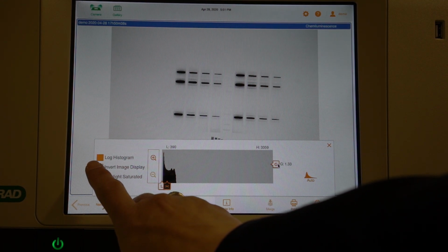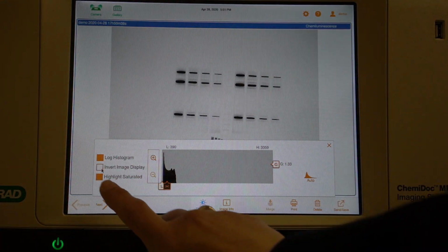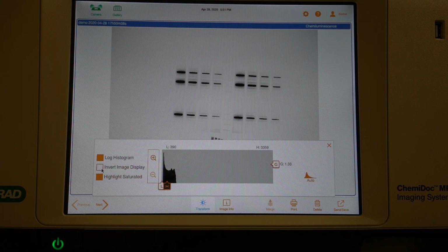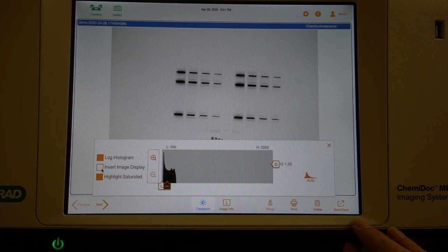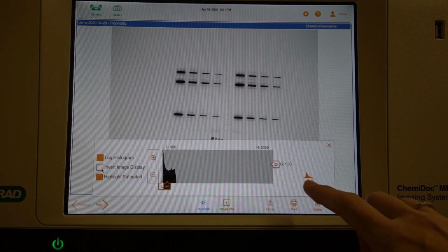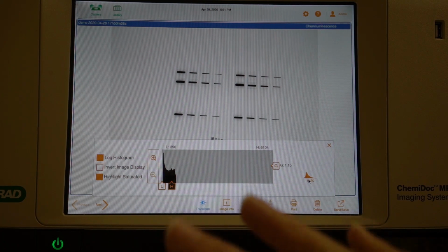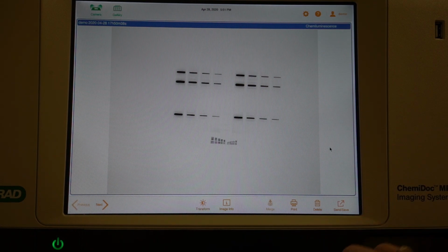You do have the option here to invert your image display. And you also always want to keep your highlighted saturated pixels highlighted there. And what that does is if you have any saturated pixels, you will see a red dot where those pixels are. So that can give you a warning if you are oversaturated. There's also a button here, auto. So if you want to just go back to the original way the image looked, you hit that button there.